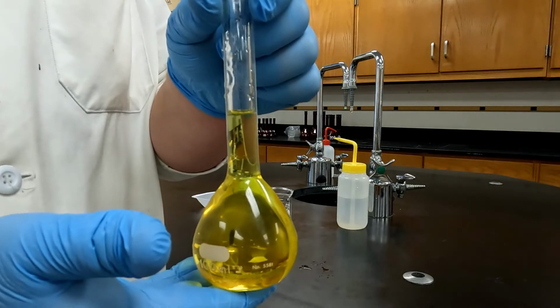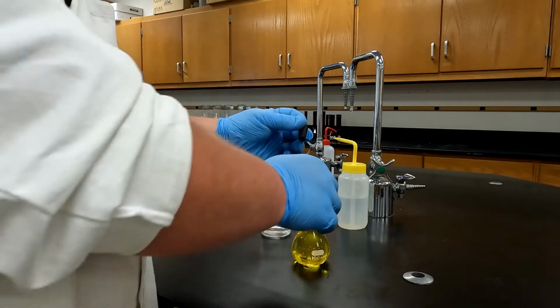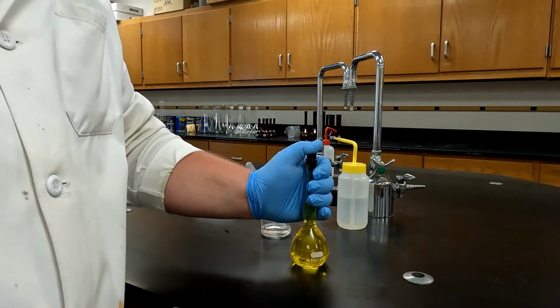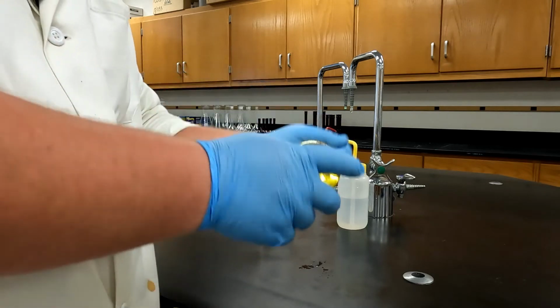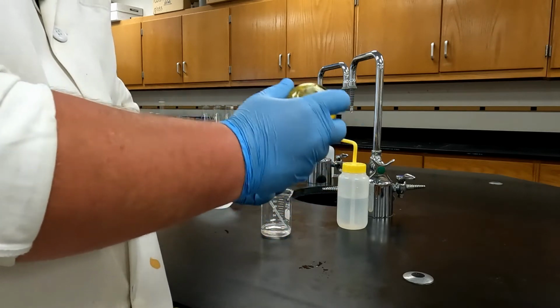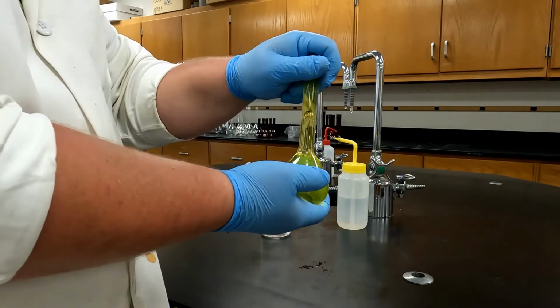So now I can see the meniscus is directly on the line. I'm going to put the rubber stopper in the top of the flask. I'm then going to use my thumb, or my finger, and hold this rubber stopper in place, and then I'm going to invert this bottle several times. I'm going to get the bubble up top, and then I'm going to shake a little bit and keep inverting.